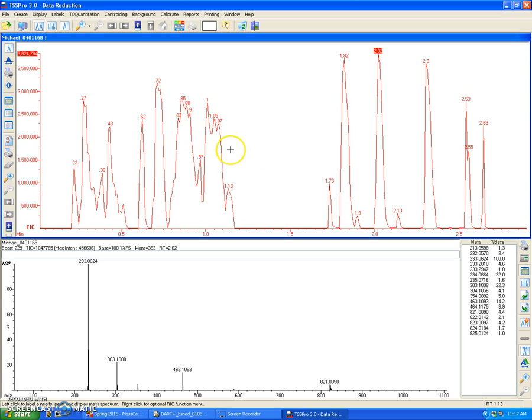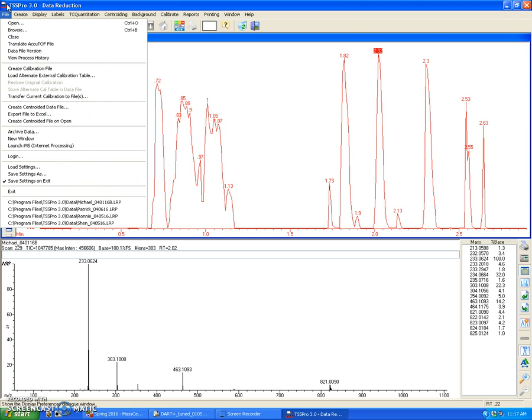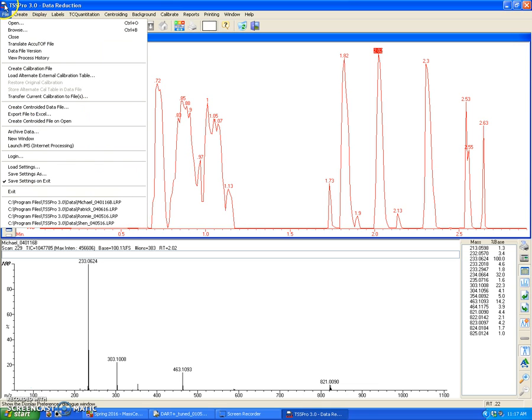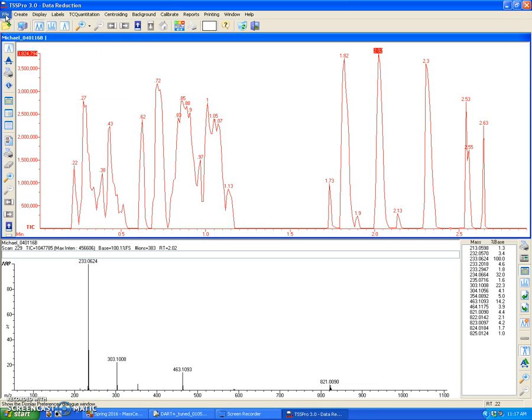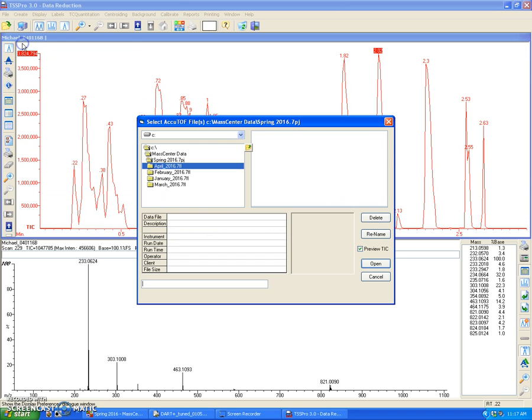Okay, so this data file here is the data file of the person who used this last. So to open your data file, what you're going to have to do is translate the JEOL AccuTOF file to a TSS 3.0 file. And this is done by going to the File menu, Translate AccuTOF file, and then navigating to the location to where your data file was saved.